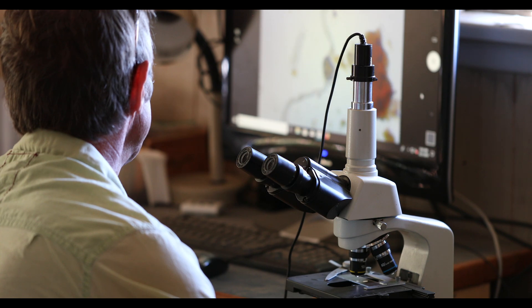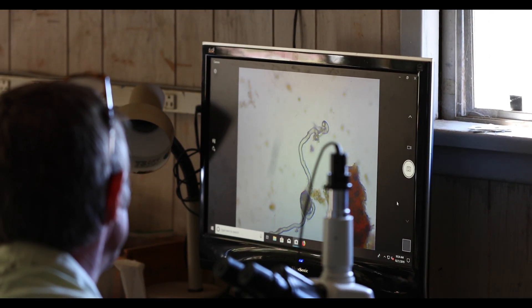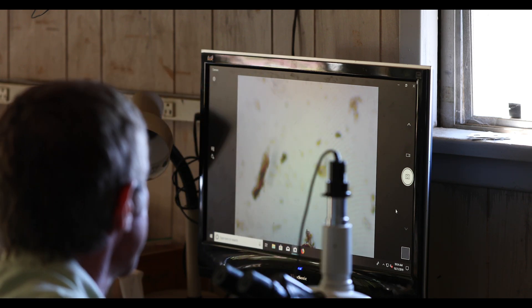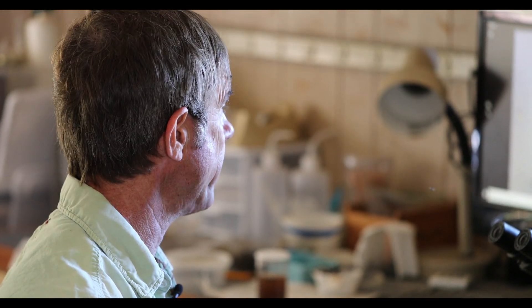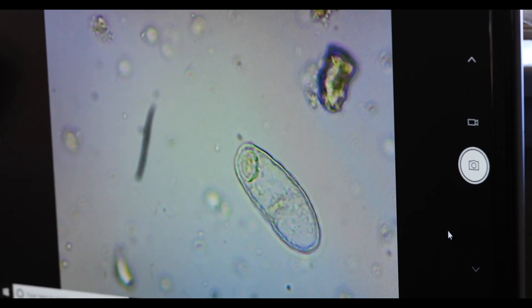We're going to assess the soil food web presence in our compost — this is just our raw compost sample. Looks like a fungal hyphae to me. I don't see any cross walls; it's pretty wide, it's light. That's the sort of thing we're looking for — fungal hyphae. We're just looking for the presence of beneficial members of the soil food web. What we don't want to see is ciliates, which occur in anaerobic conditions. If we see flagellates here that would be great. But we commonly in our compost see testate amoeba — the test is a shell, so this is a shelled amoeba. These ones are inside a shell, so we've got a testate amoeba up there.